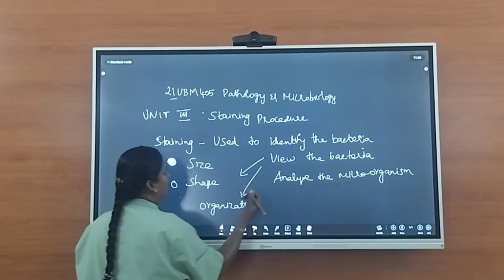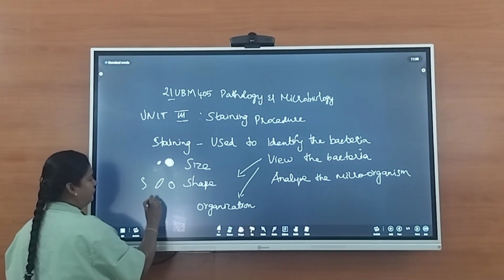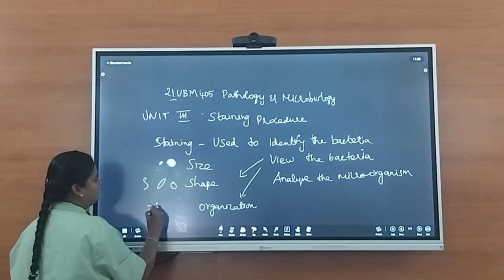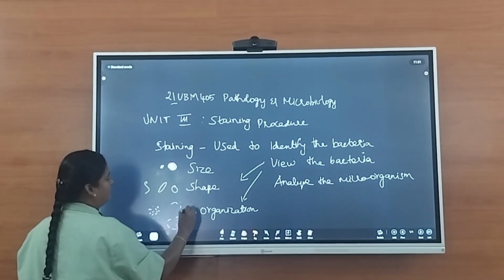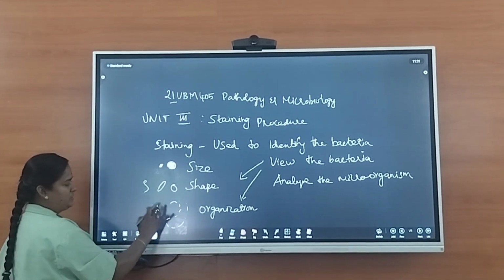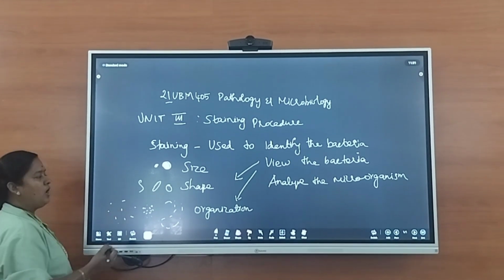Structural organization means whether the bacteria is in cluster form, or chain-like form, or scattered manner.